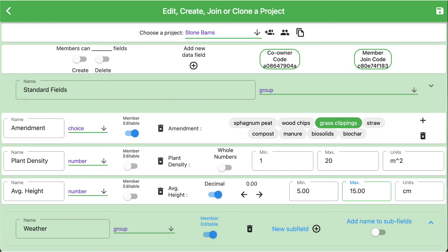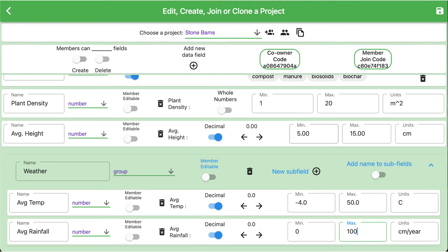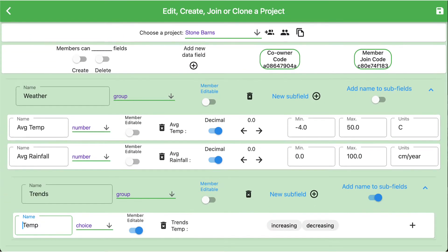Many of the other field types don't have options to set up. However, there is a special group field that needs to be introduced. The group field is a container for other fields. As you can see here, we have clicked new subfield and added two subfields to the weather group called average temp and average rainfall, and we've set our minimums and maximums and our units. We can also have subgroups within a group. Weather was our first group, with two subfields: average temp and average rainfall. Now we have a subgroup within the weather group called trends, and we have an item called temp inside trends. So you can nest groups within groups.